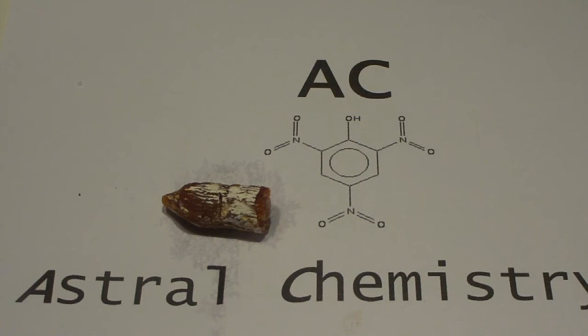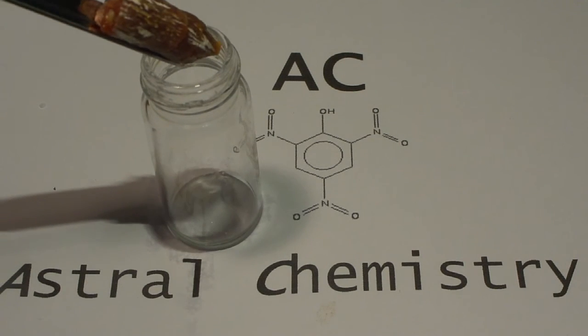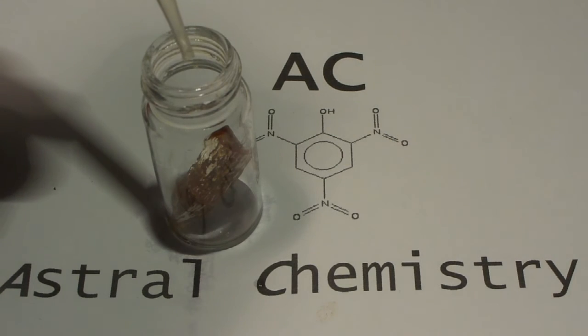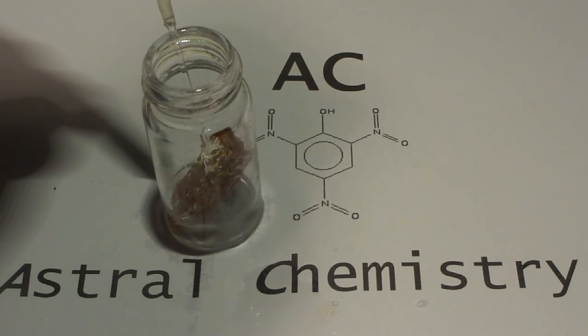Now, let's do a more useful and realistic test with our Lunges reagent. Here we have a small piece of a tasty sausage. As we know, nitrites are often used as meat preservatives. They also form this nice red color, which actually comes from carcinogenic nitrosamines. In case you wonder, yes, we are too lazy to just read the package and see if the manufacturer used nitrite. Let's add the piece to a small vial, followed by some distilled water. We let the sausage sit in the water for a few minutes, in order to dissolve some of the nitrite which could be present.